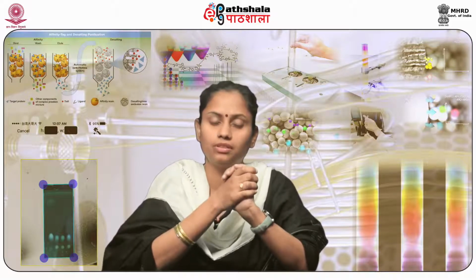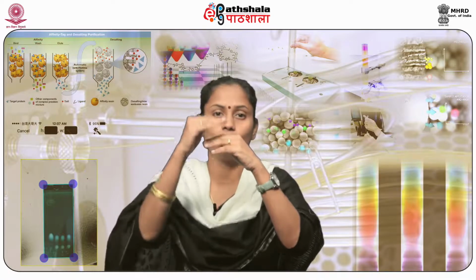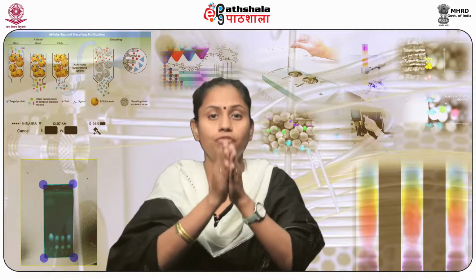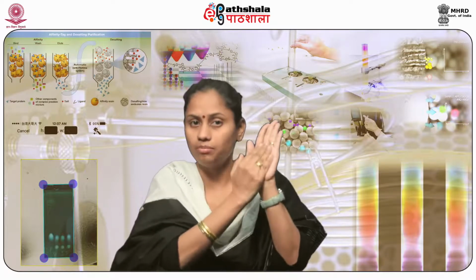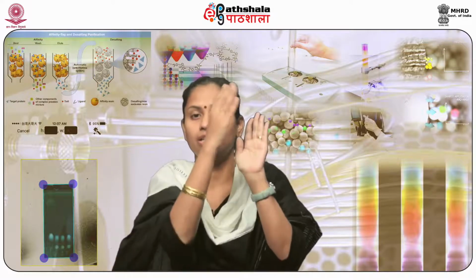Now, when selecting the equilibration buffer, the pH and ionic strength should be taken into consideration so as to ensure that when the sample is loaded, molecules of interest bind to the matrix and as many impurities as possible do not bind and elute out.